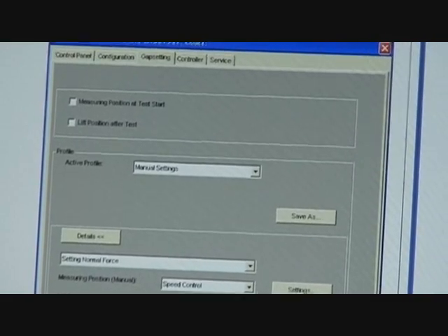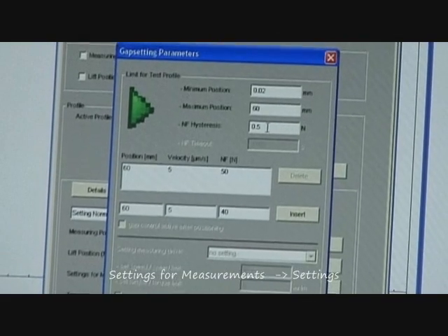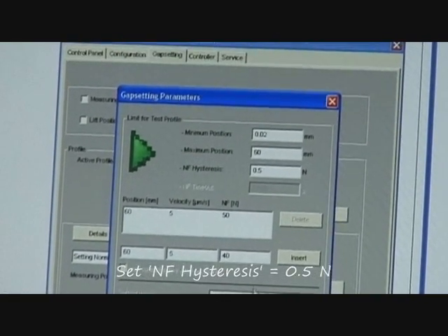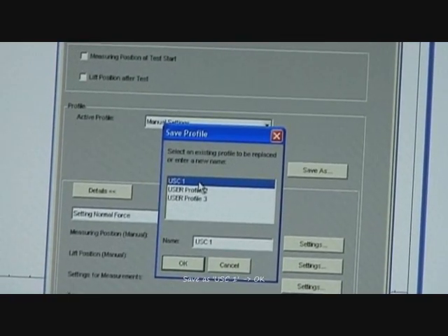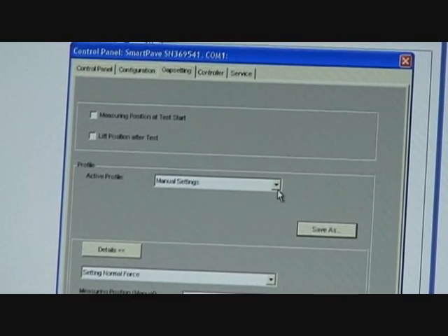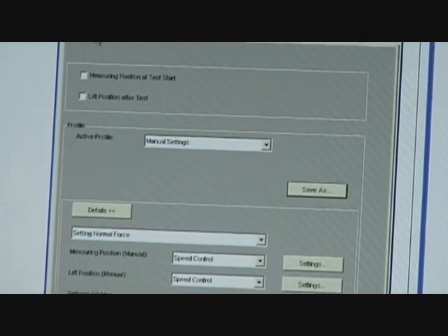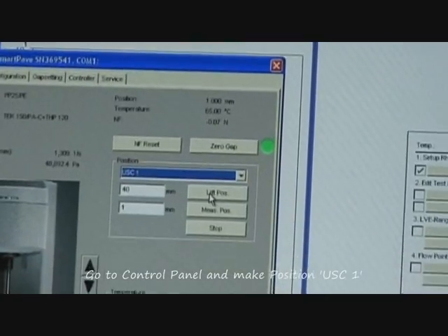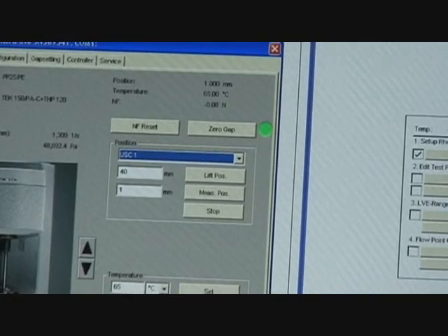Now I can come down here and I can edit it. For the measuring system, I said okay, I want a normal force hysteresis of plus or minus 0.5 newtons. Clicked okay, and then I clicked 'Save As' and now I'm saving it back as USC1. So now those are changed. Let's save as USC1. I go back to the control panel and make sure that the gap setting protocol is for USC1, because that's going to have my new hysteresis window.